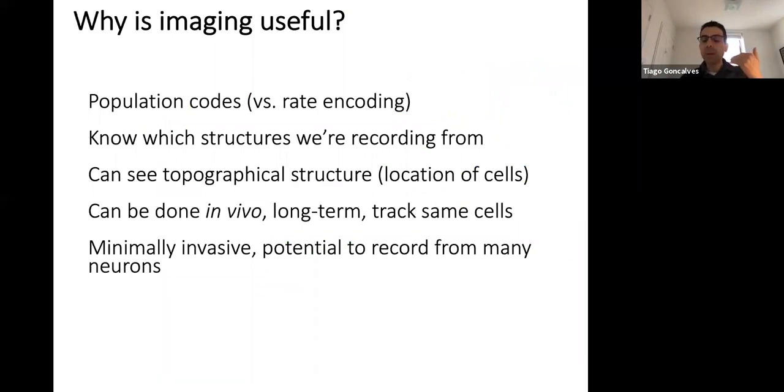You already talked about electrophysiology. You talked about all of these arrays and silicon probes and tetrodes for recording activity in vivo. And you have even these other options, which are recording bulk signal from GCaMP, where you can see the variation in the activity of cells during behavior in mice that are almost freely moving, they're still tethered. So why is imaging useful at all?